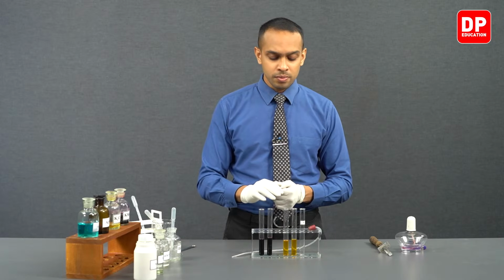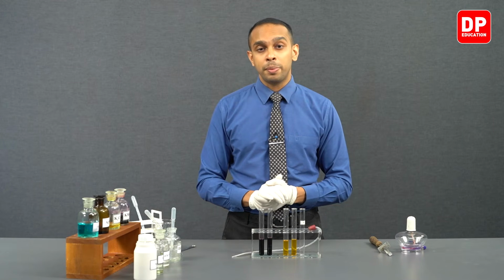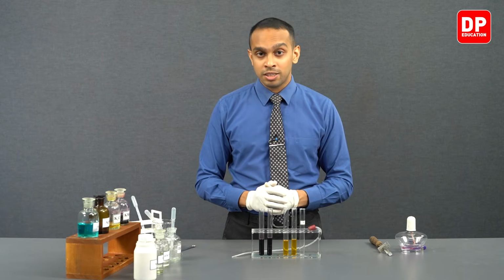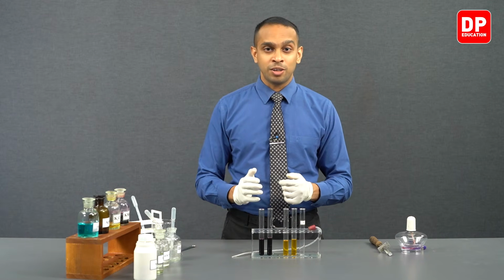So therefore the solution will turn milky due to sulfur being formed in the form of colloidal sulfur, which is going to be dispersed throughout the aqueous medium, forming a milky solution. So milky solution mixed with a green color solution together will form a very unclear milky solution. So that is what is going to happen when we send hydrogen sulfide through the acidified potassium dichromate.